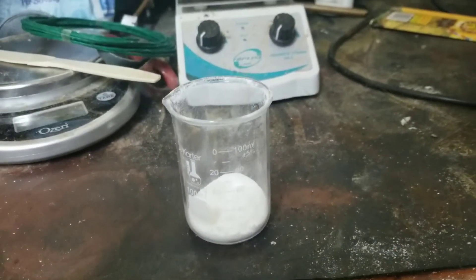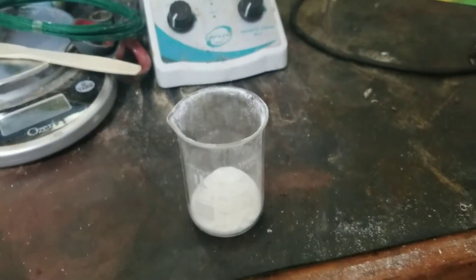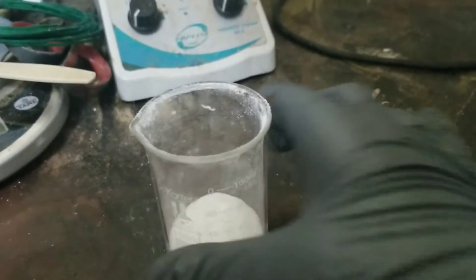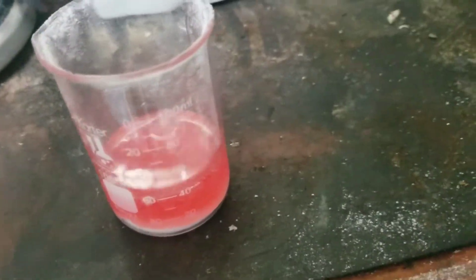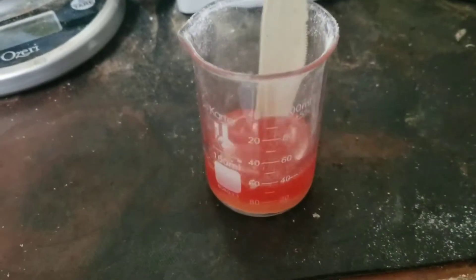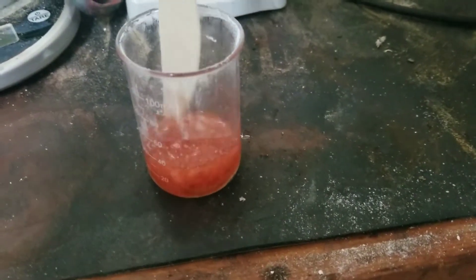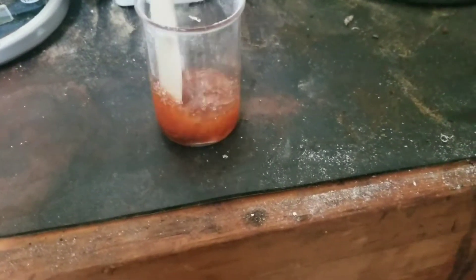Today we're going to do the reaction between sugar and sulfuric acid. All I have to do is pour the sulfuric acid on it and it will react. I'm going to stir it using this plastic knife — stir it up nice and good.